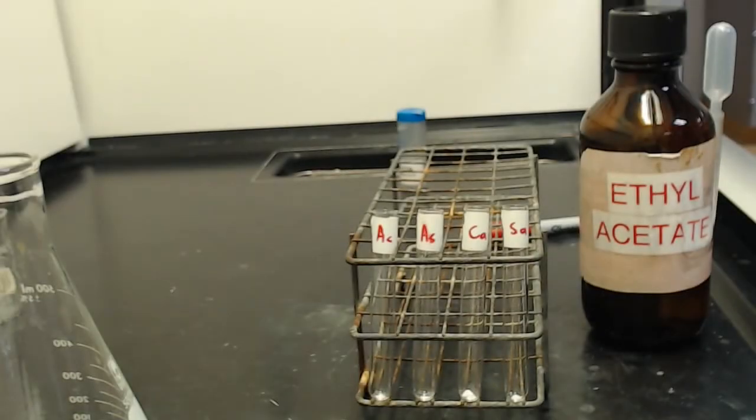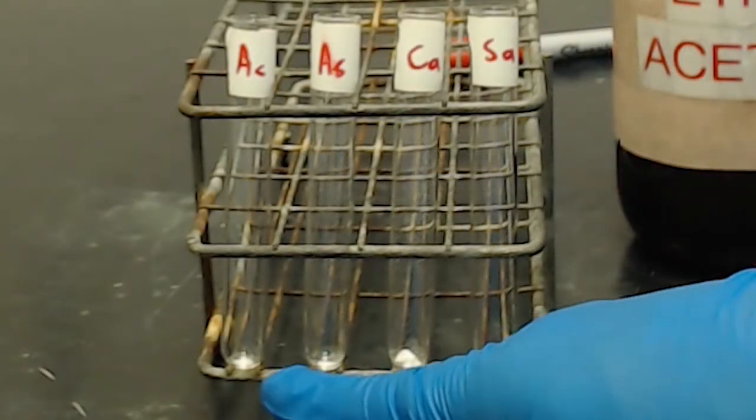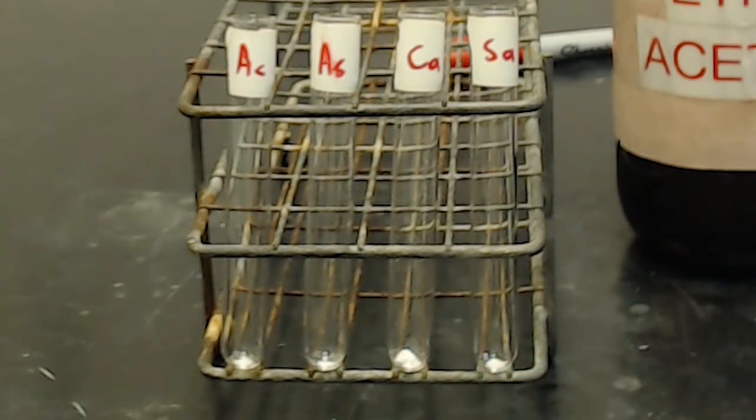Okay, I think we are now ready to get started. I'm going to start off first by making our analgesic solution that we're going to be analyzing by thin layer chromatography. What I did ahead of time was take 4 test tubes and put a little bit of each of the different solids in there. I didn't weigh them out or anything; the tip of a spatula was enough. Quite honestly, I think I actually have too much sample for each of these, but we'll see how it turns out.